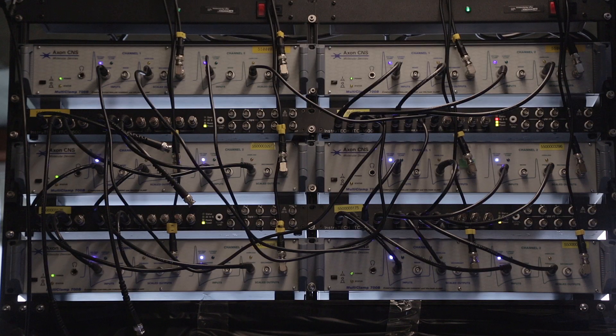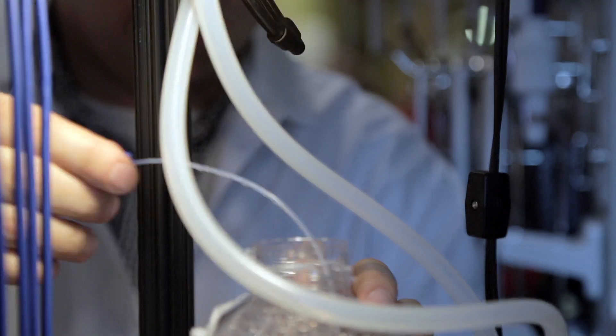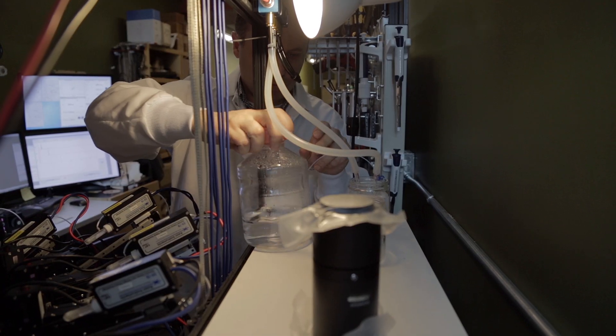And then finally there are the life support tools that keep the tissue you're recording from artificially alive. It's important to try this multi-patching because it's simple math — if I can get 10 recordings at a time, that's equivalent to a month's work by a person doing two recordings at a time. So if it does work, it would take an army of people to keep up with it.